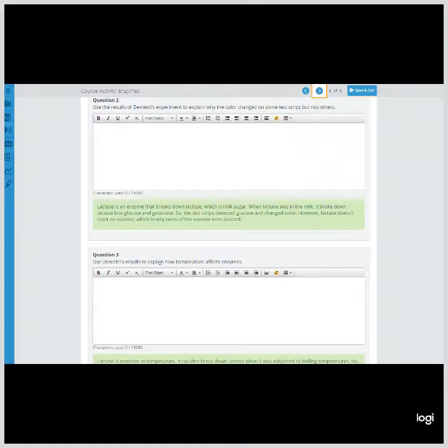So right here, you're going to want to talk about how maybe in test tube 2 it was positive, but in test tube 3 it was negative, and that has to do with the factor that heat was applied to the enzyme. The other part is that in test tubes 4, 5, and 6 you're testing sugar. Sugar is not lactose. So if it's not lactose, the enzyme would not break apart sugar, so it can't break it apart.